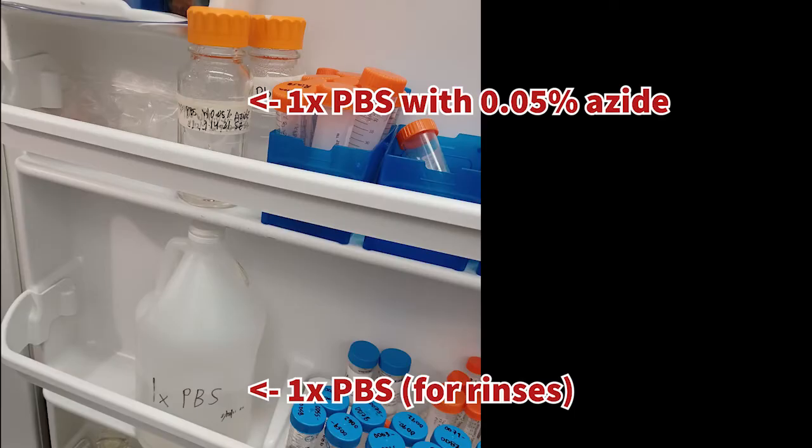After you finish the three PBS rinses, rinsing is now complete. We will now prepare the netwells for wet storage in the fridge. Grab the 250ml bottle labeled PBS with 0.05% azide.